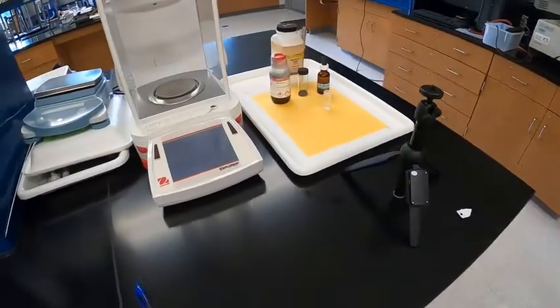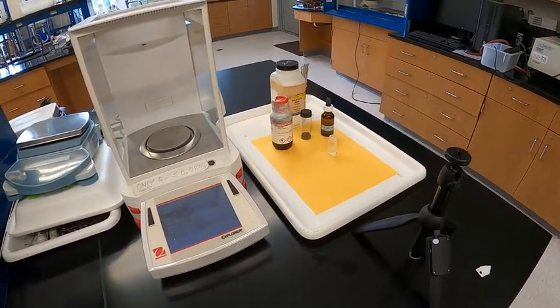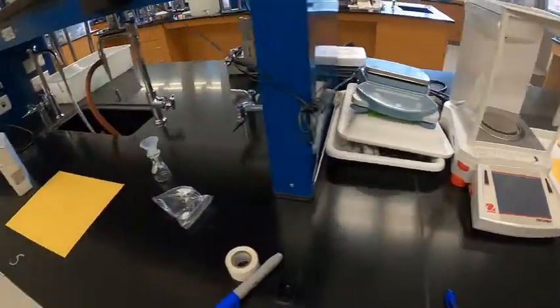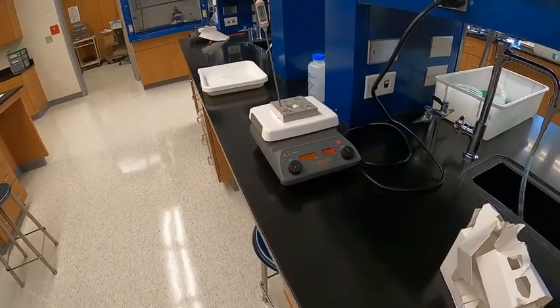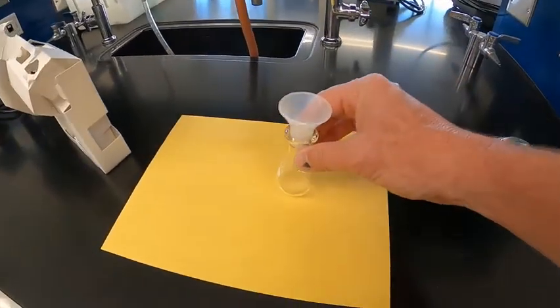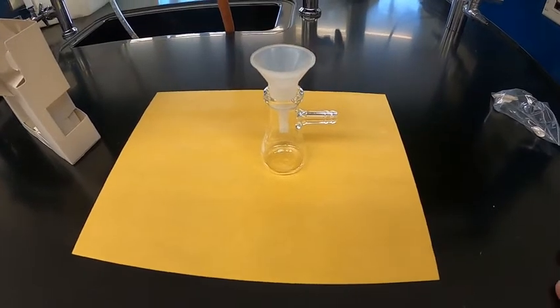Back on the synthesis side, I'll first mass out the materials, add additional reactants including phosphoric acid and acetic anhydride, and then we'll come over to our hot plate and let the reaction react for about 15 minutes. Then we'll assemble what's called a Buchner funnel. I'll explain it when we get there, but that's what we use to do the filtration.